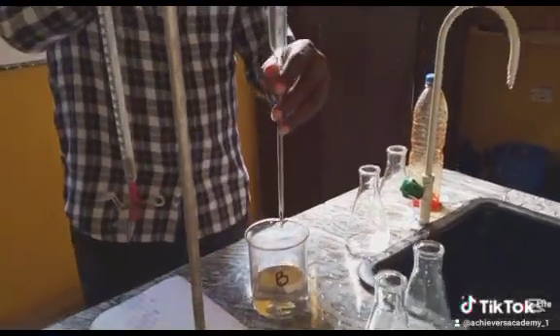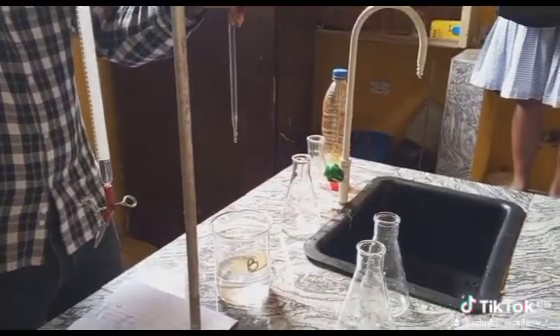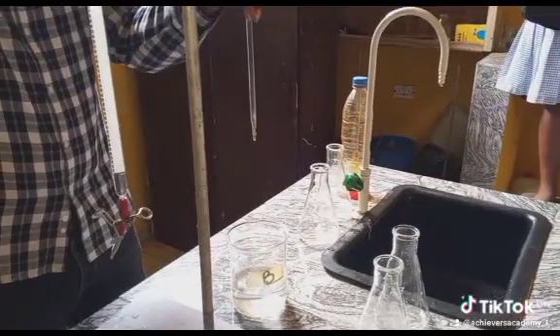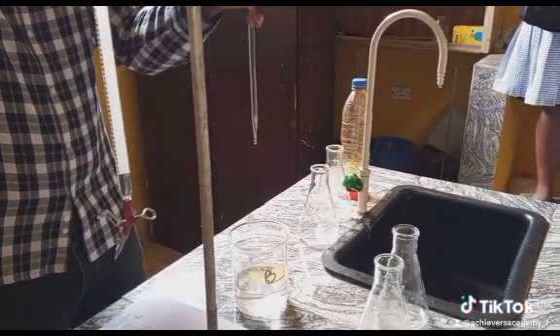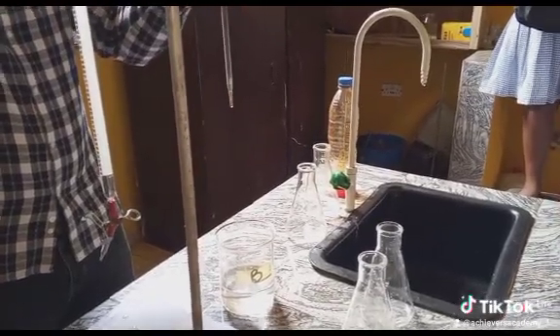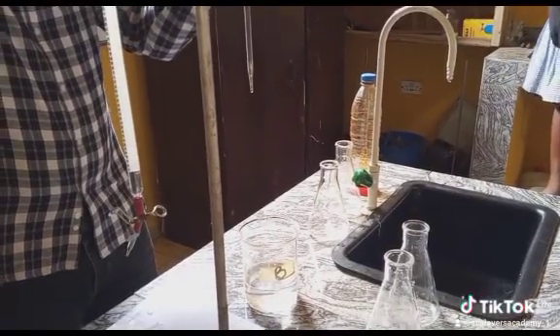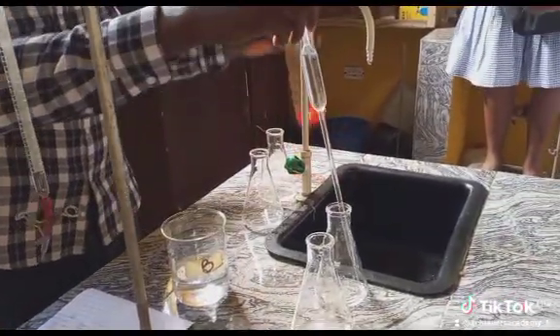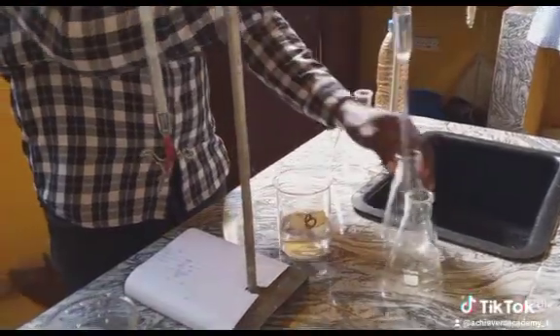If you trust yourself so much, you can step up and put two drops each of the indicator into the already filled conical flask. If there's any one of you that trusts himself or herself, you can come and fill. Don't I have students that are confident enough? 2 drops each, 2 drops of the methyl orange each into the already filled conical flask. Somebody should come and do it.